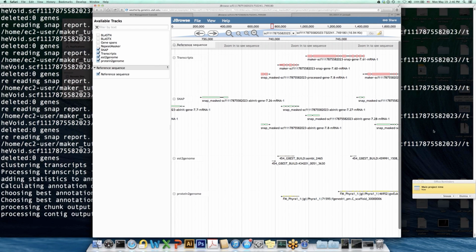For your initial pass, protein to genome can be better if your organism is closely related to the organism you're aligning proteins with. Many organisms work just fine, especially if your ESTs are partial. Some newer genomes, I know, for example with lamprey, there was just nothing close to it, and proteins did not align well across species for some reason.